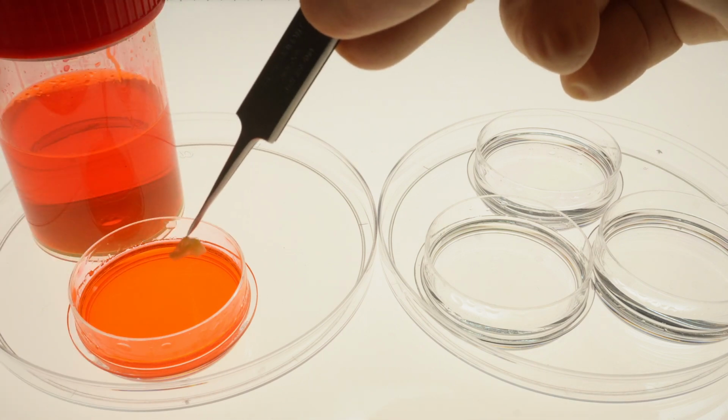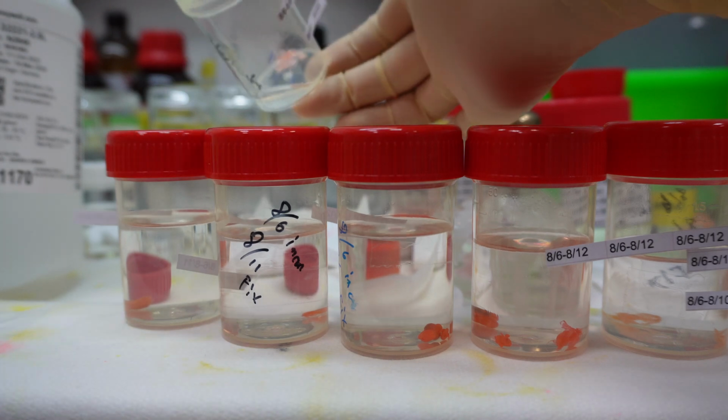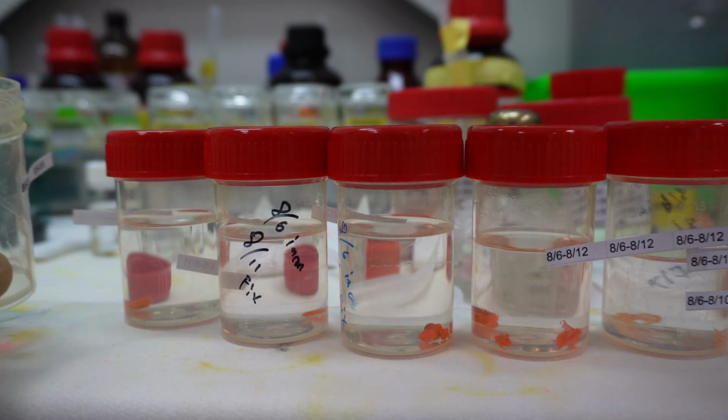Usually something like that, yeah. Starting maybe at 70% and going incrementally up to 100% pure ethanol. This gradually pulls the water out and replaces it with alcohol. Swapping liquids inside the cells, slowly. That's a good way to think about it.